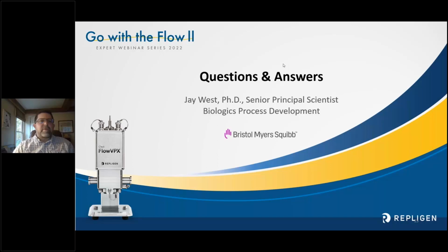So that's actually a little bit ahead of the curve now, because, well, I'll step back. In the pilot scale, it has helped quite a bit in that they've used the VPE, up until 2 years ago now the VPX, to decide when to stop for that UF2 concentration set point. When you're doing it by mass, say in the clinical manufacturer, they have to wait several hours to get this back.